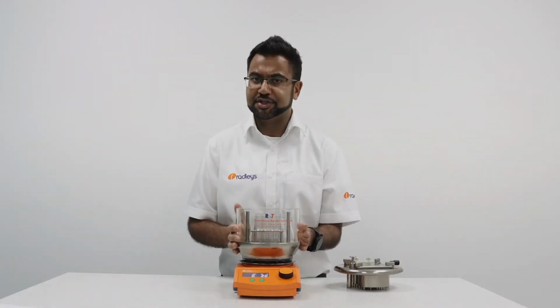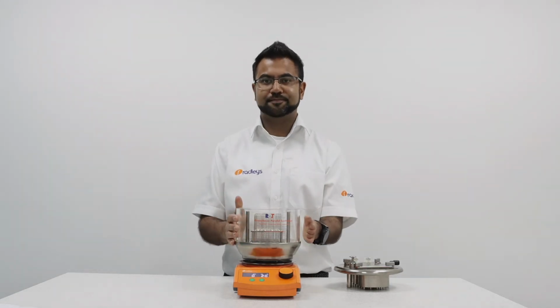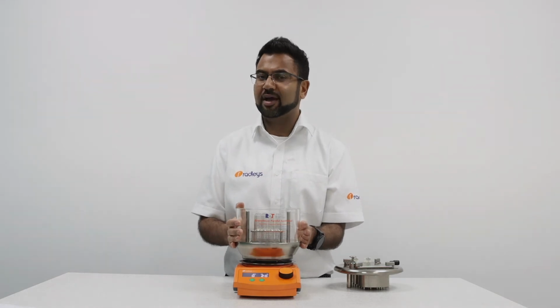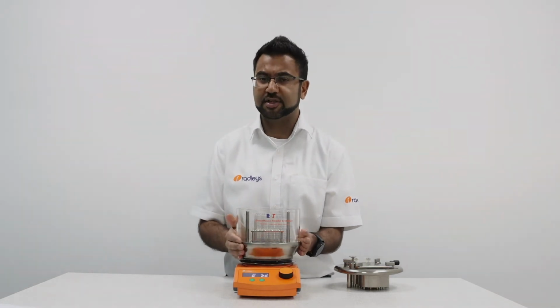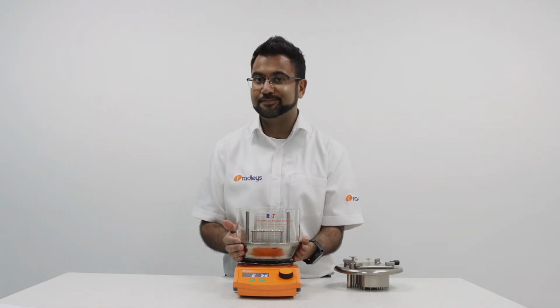For most applications, a cold tap water supply provides adequate cooling. When using low boiling point solvents or working at elevated temperatures above ambient, a chilled water supply is highly recommended. Remember, when refluxing, try not to overfill your tubes or boil your solvents vigorously.